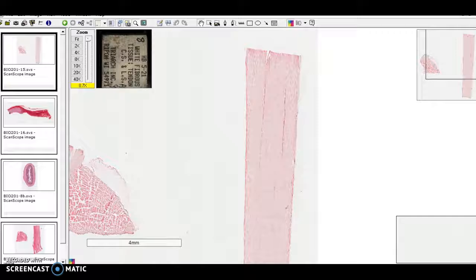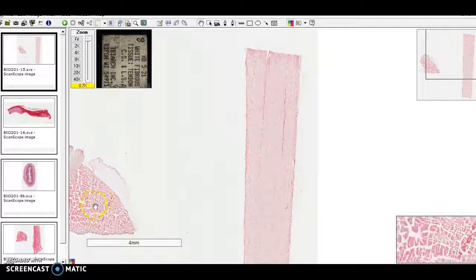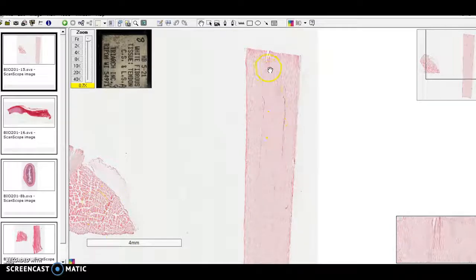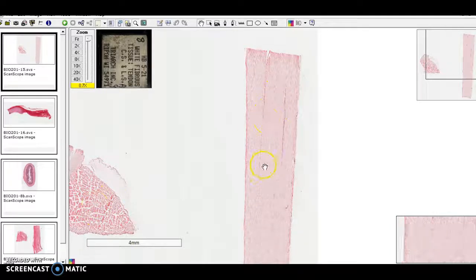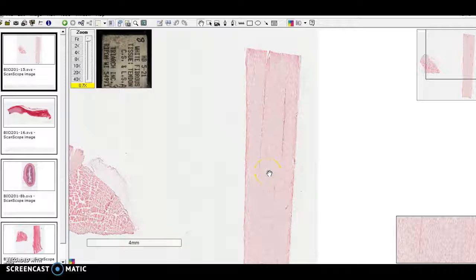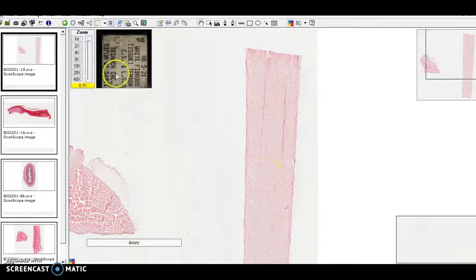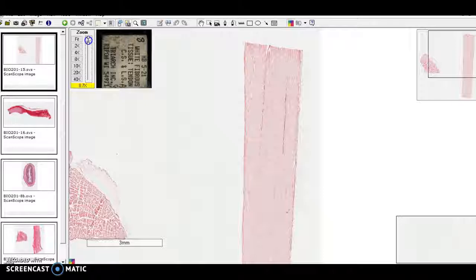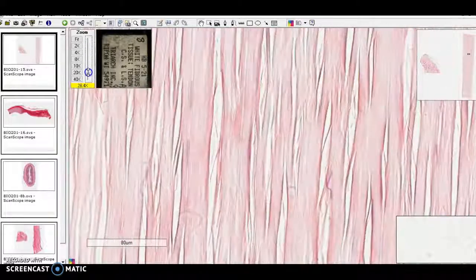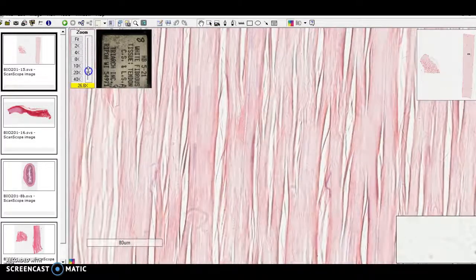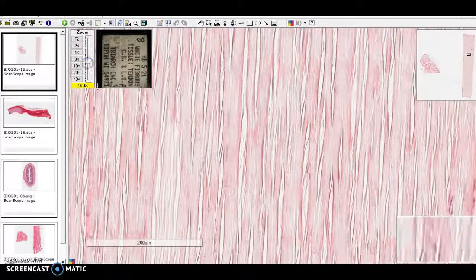So let's zoom in. This particular slide has cross-section and a longitudinal section of a tendon, and the longitudinal section tends to be a little more illustrative, a little easier to recognize.